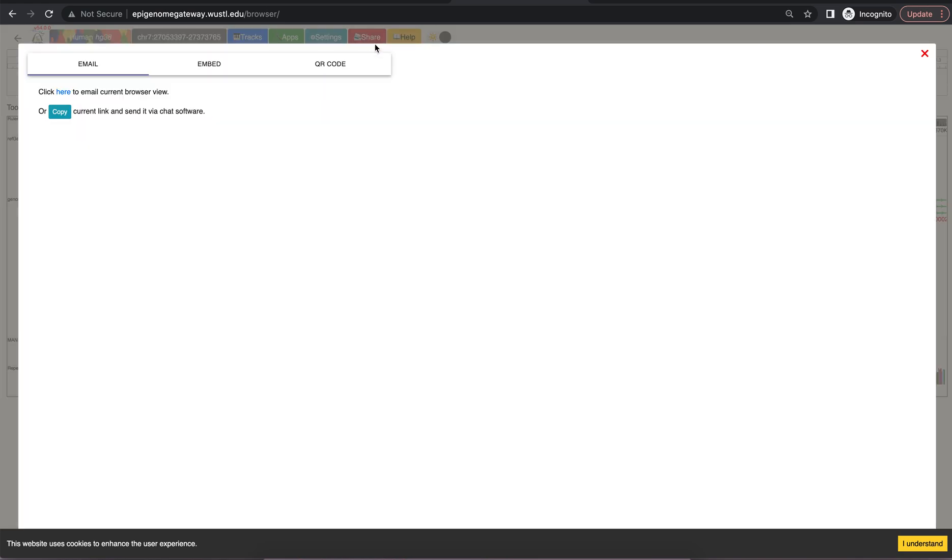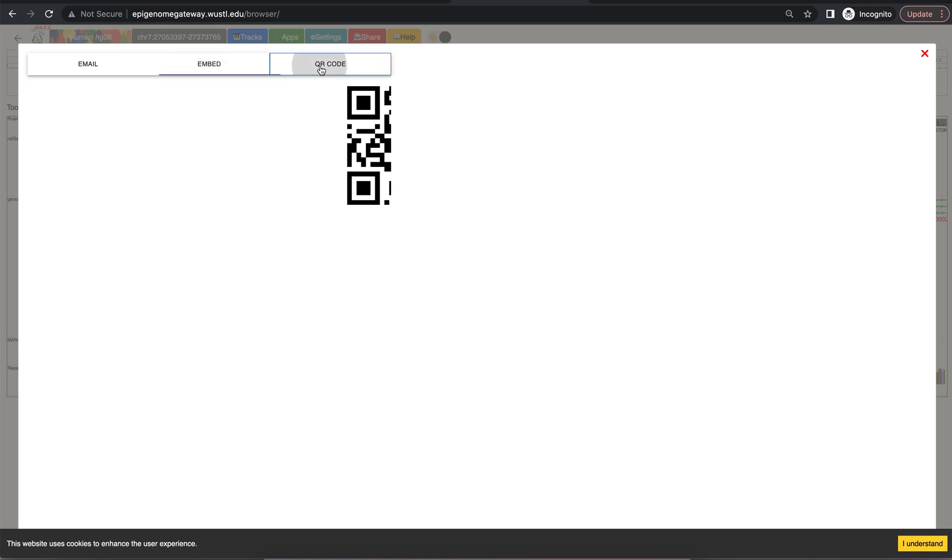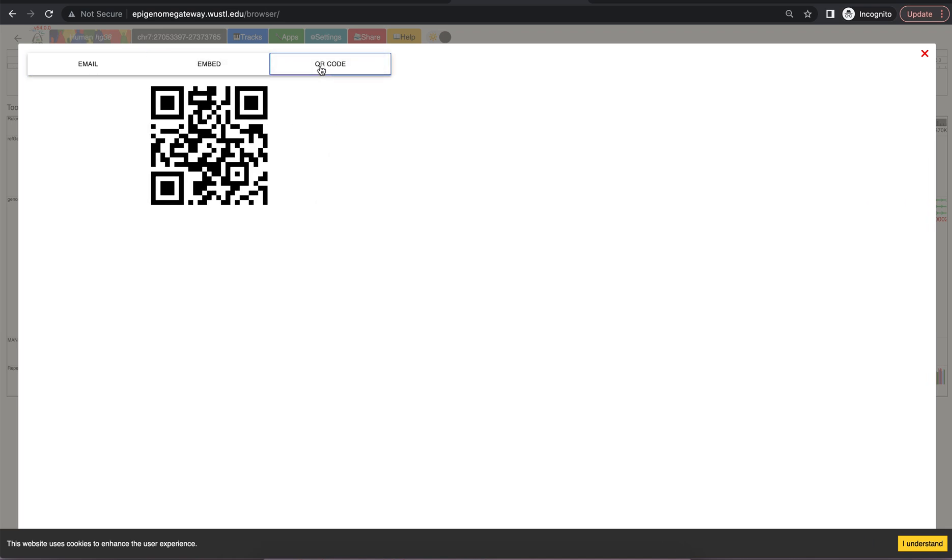The share option allows you to email using an embedded link or a QR code to either share your session with collaborators or to have on a poster.